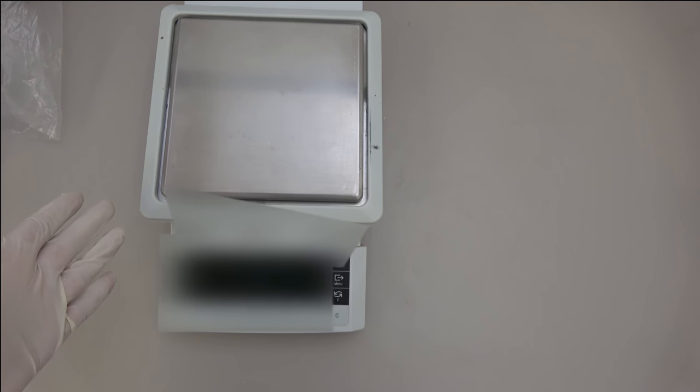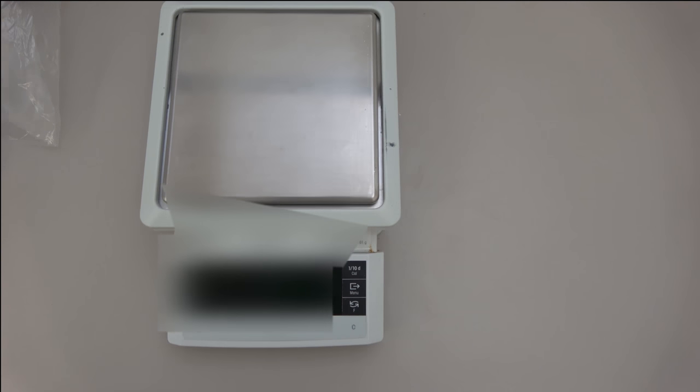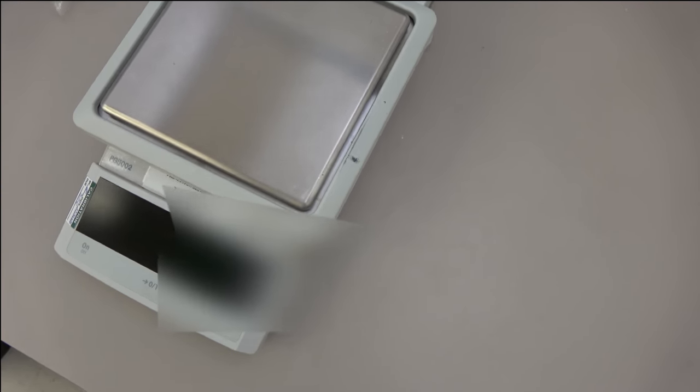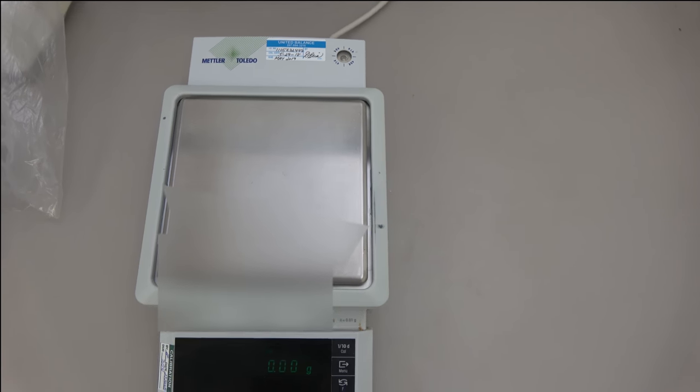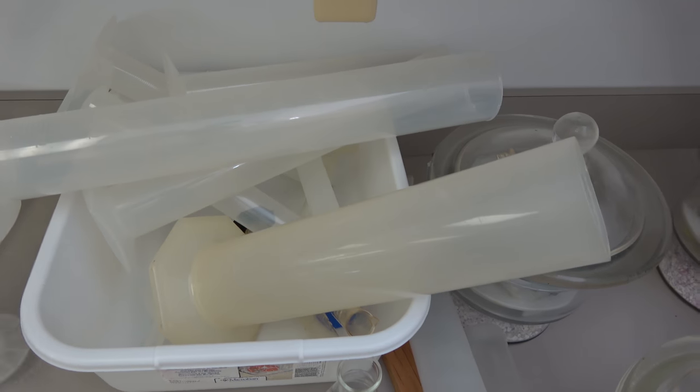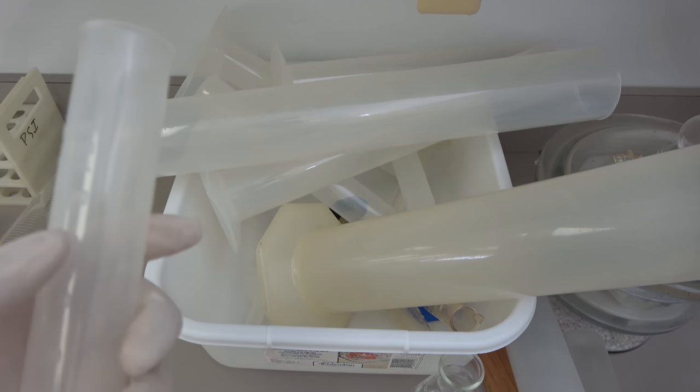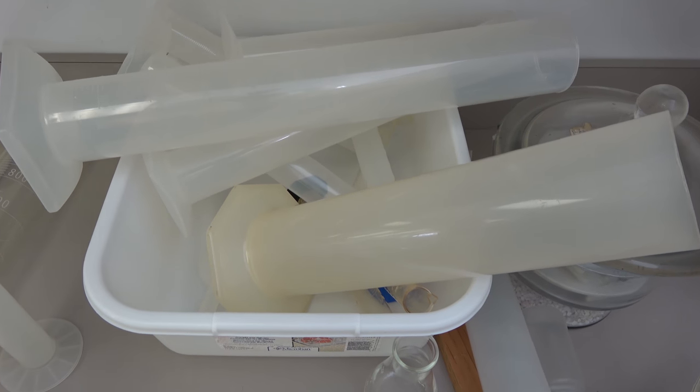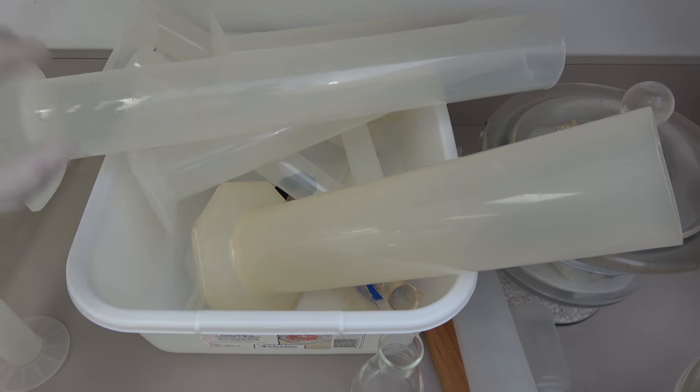This is, we here we like to call it a top loader balance. It's nowhere near as accurate as the analytical balance but if you're weighing a lot of big stuff you know gross amounts you would use something like this. Here are a bunch of graduated cylinders. Not much really to talk about them. They're self-explanatory. They're just like whores. You know they're always available. Always here for you. You can use them whenever.